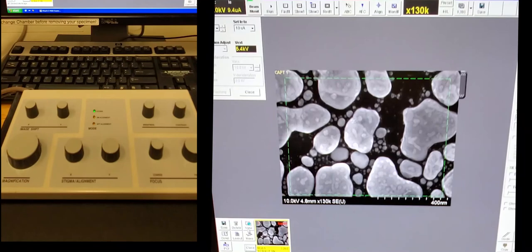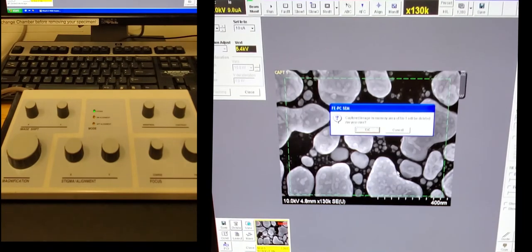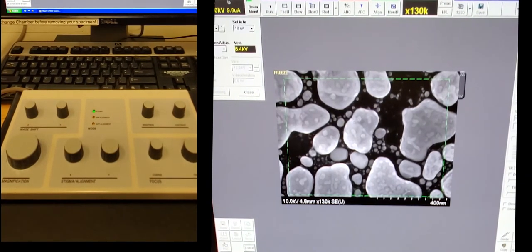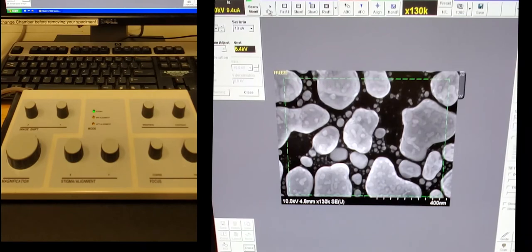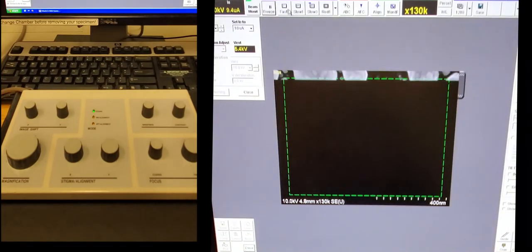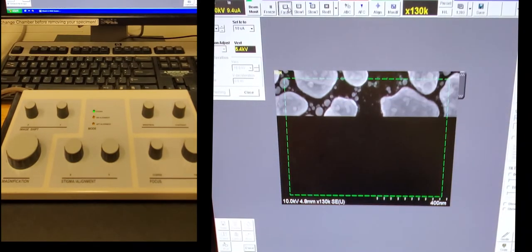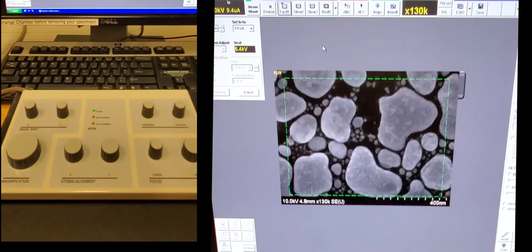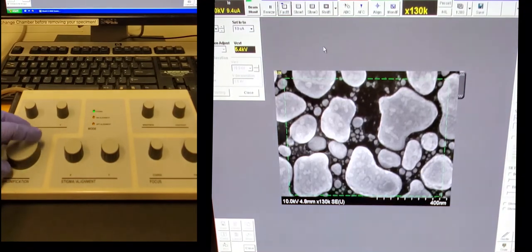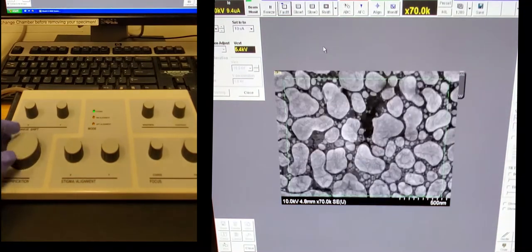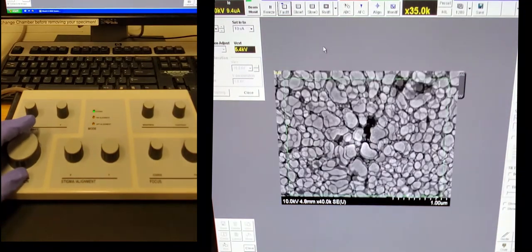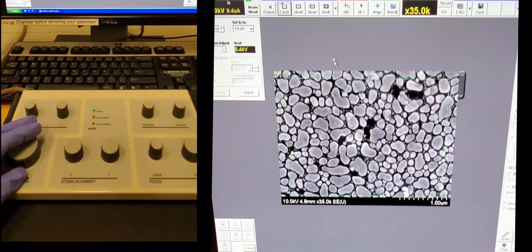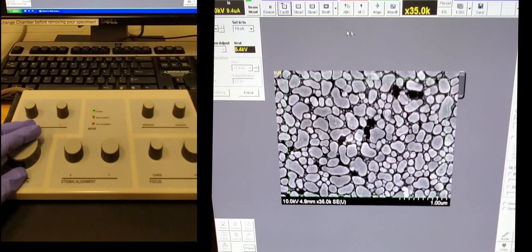So at the very end, make sure you delete all of the images in preparation for the next user who's coming in. When you want to go back to imaging, you press run and then choose your scan speed. And so the steps are pretty much the same after this.